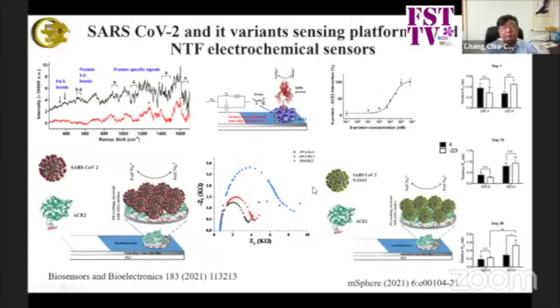First of all, people may wonder whether the refolded proteins are functional or not. In our study, as I mentioned, we can immobilize the ACE2 on the electrode surface, and then we test whether the spike protein binds with it or not. Here are the interaction ratios, and you can find that their dissociation constant can be determined.